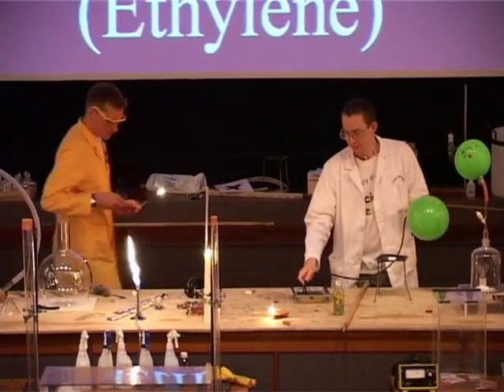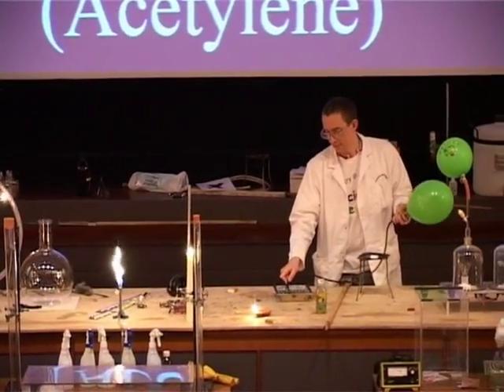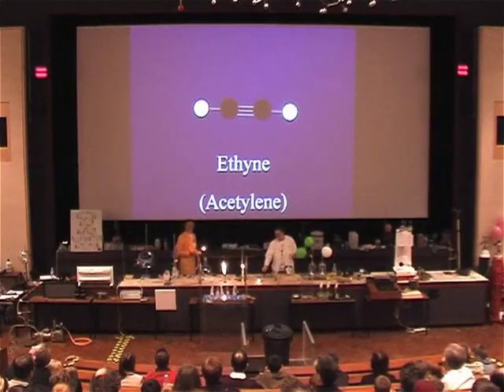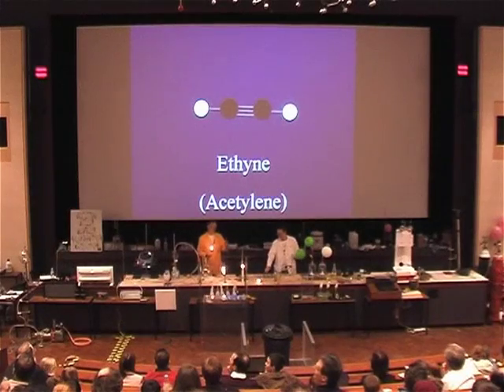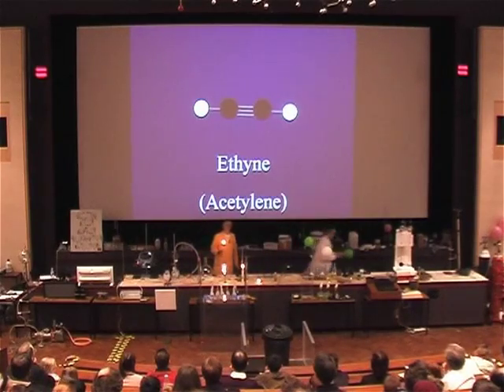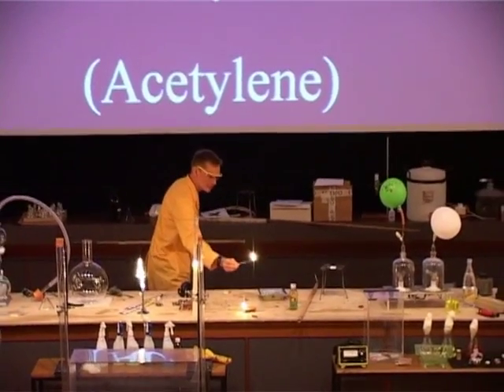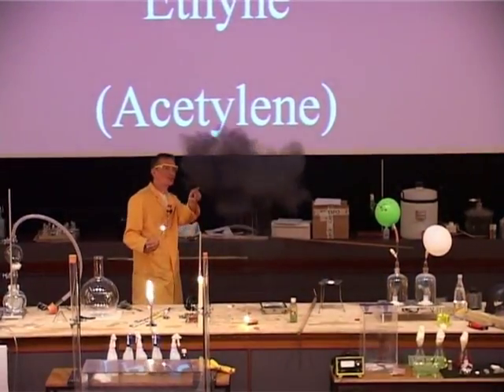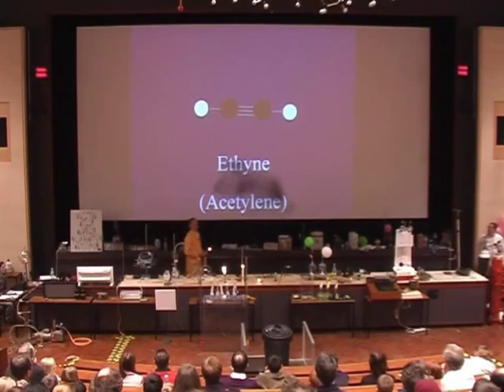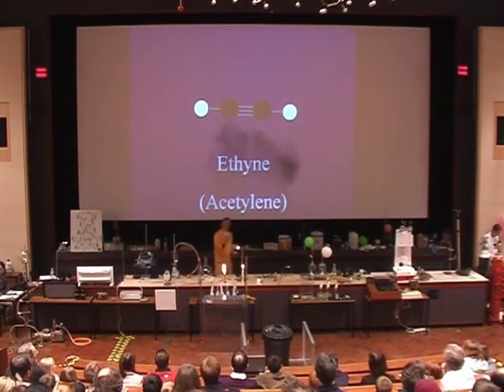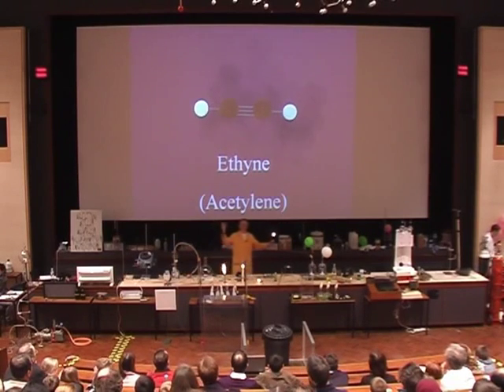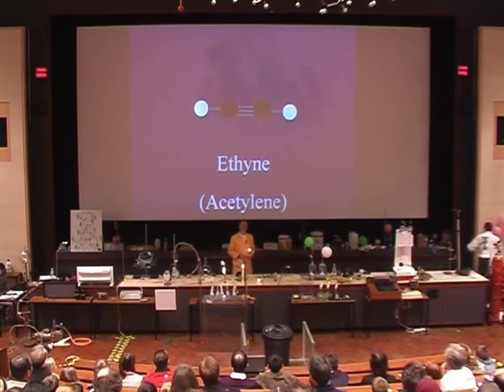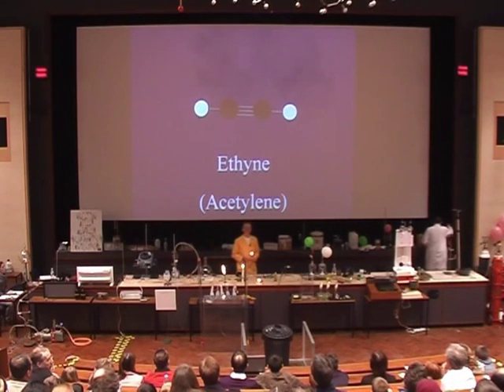Now the final gas we're going to use here is ethyne, and this has two carbons again, but only two hydrogens. Now look very carefully at this flame — if we have the lights up for this one please. Look at the soot. In this one there's very little hydrogen compared to the amount of carbon, and so now the whole lecture theatre is filled with this little black snow that's going to gradually come back down on top of us.